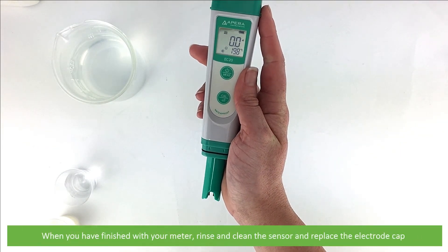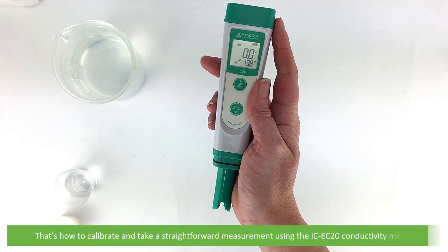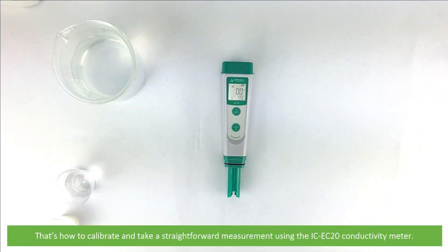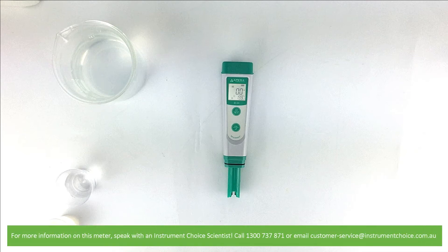When you're finished using your meter, rinse and clean the sensor then replace the electrode cap. And that's how to calibrate and take a straightforward measurement using the IC EC20 conductivity meter. For more information on this meter, speak with an Instrument Choice scientist. Call 1300 737 871 or email customer-service at instrumentchoice.com.au.